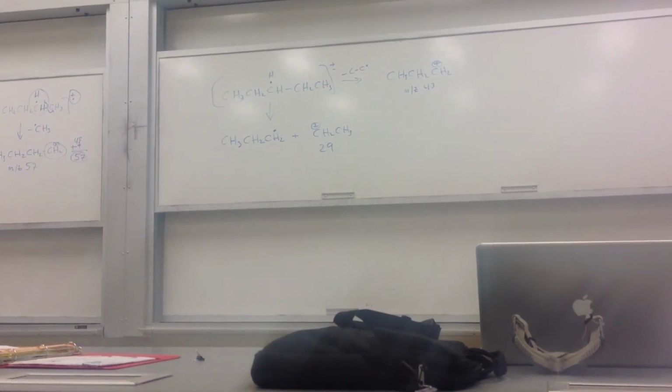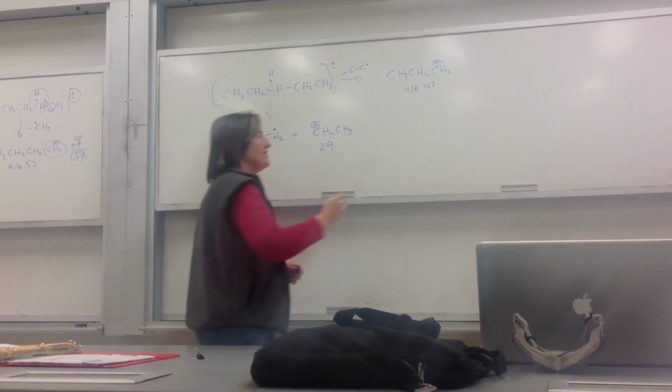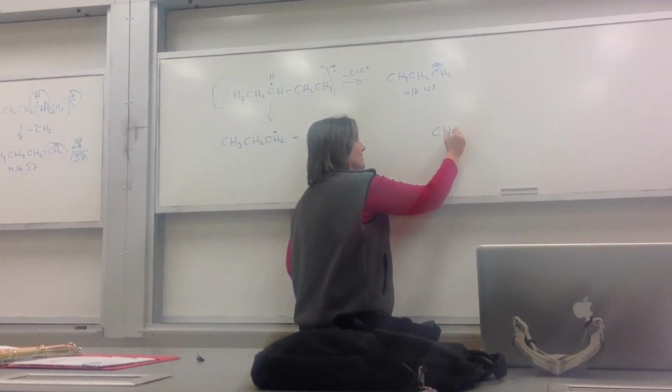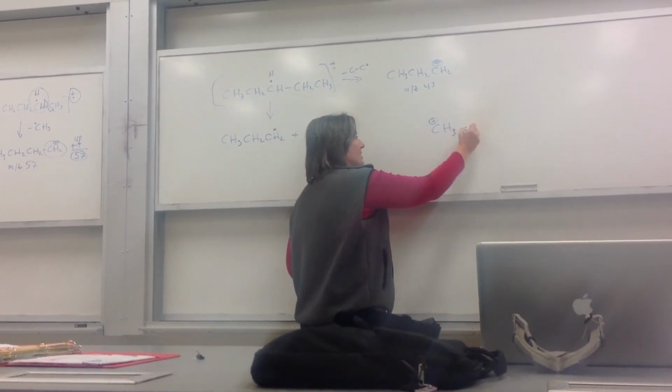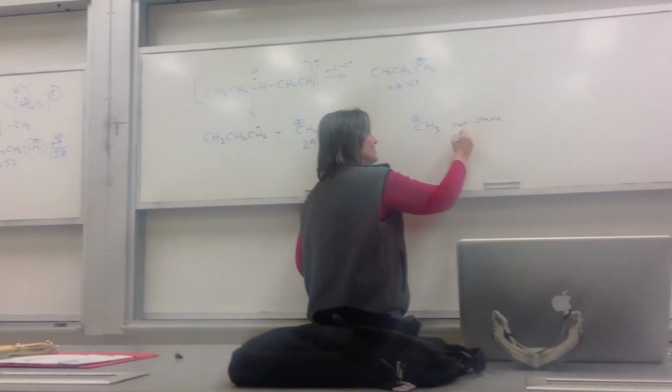And then at 15, what do you see? A CH3 plus. How likely is it to have a CH3 plus? Have we run into one in synthesis? Yeah, this is not very stable. And so, notice the peak's kind of small.